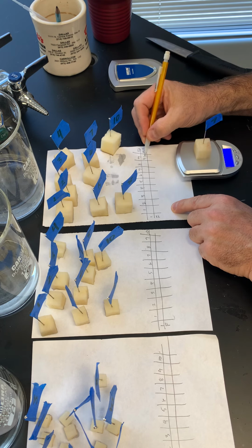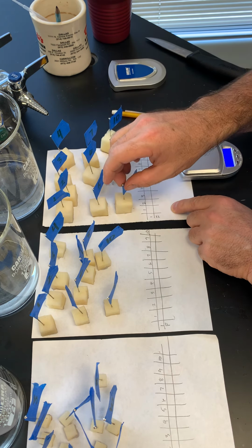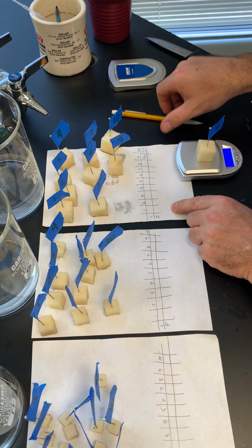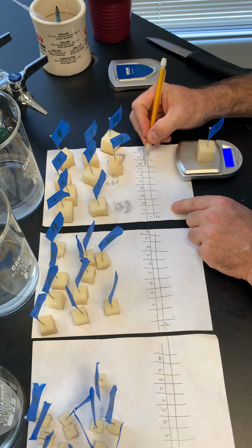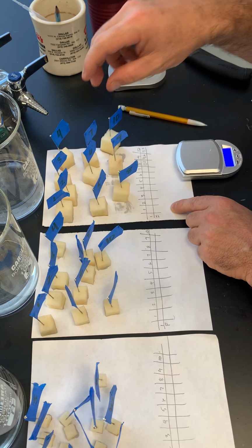9.6. And it doesn't matter that they're slightly different in their mass. They should be relatively constant because I cut them all the same size. 12.0. And they're not going to be perfect. And I'll cut one for you. You'll see. They're not going to be perfect.